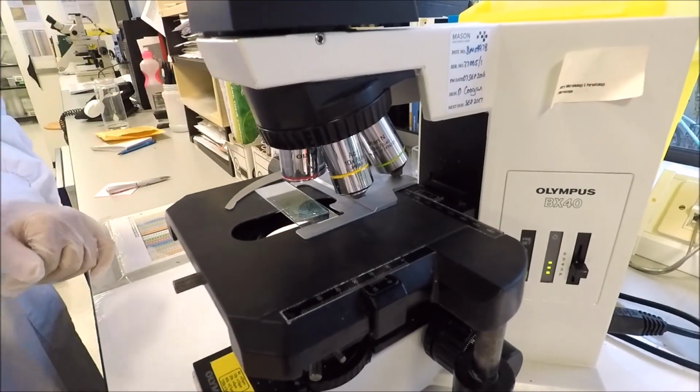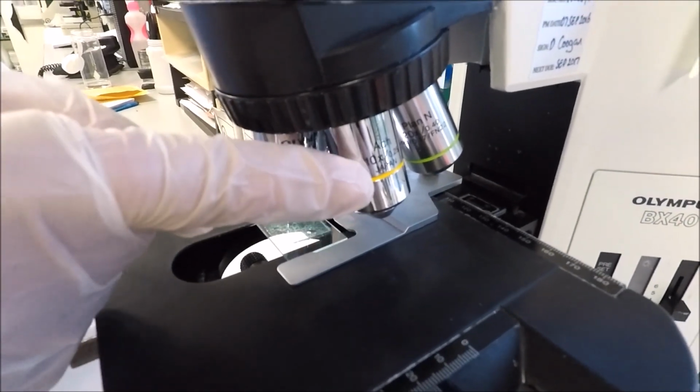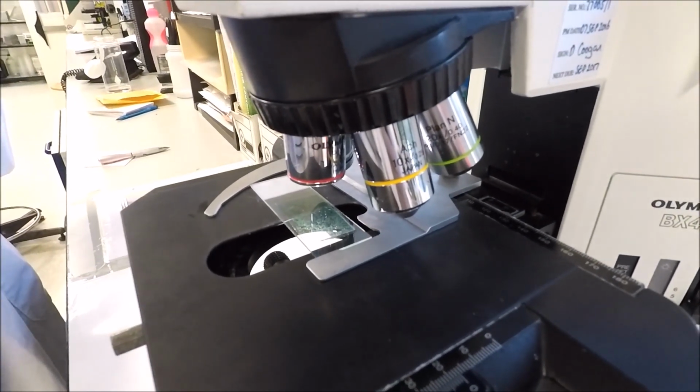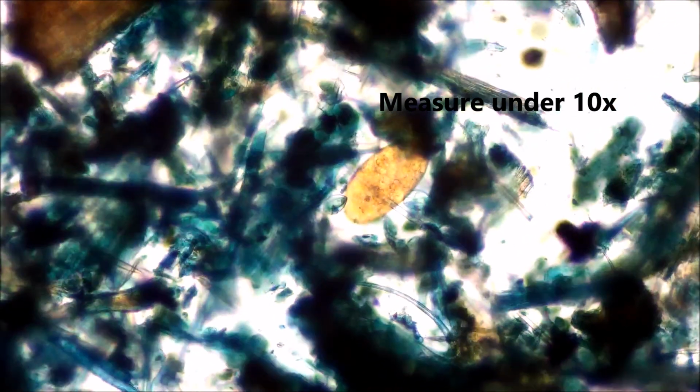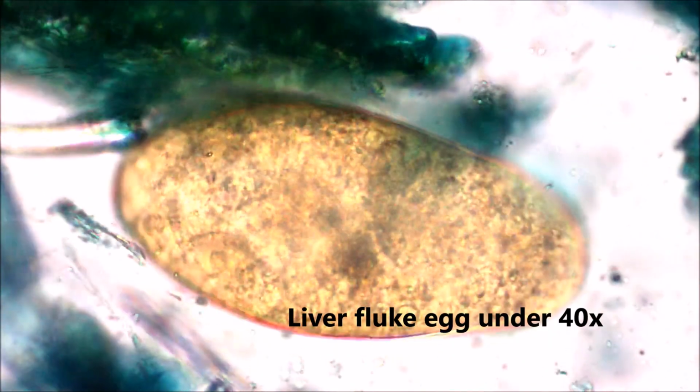Using your 4x and 10x lens, identify and measure any fluke eggs seen. Ensure you scan the whole slide for the presence of eggs. Here you can see a Fasciola hepatica egg. It is a large worm egg, approximately 130 to 145 micrometers in length. It has granular yellowish brown contents and has a pole lid or operculum. If you need to see further detail, increase your magnification to 40x.